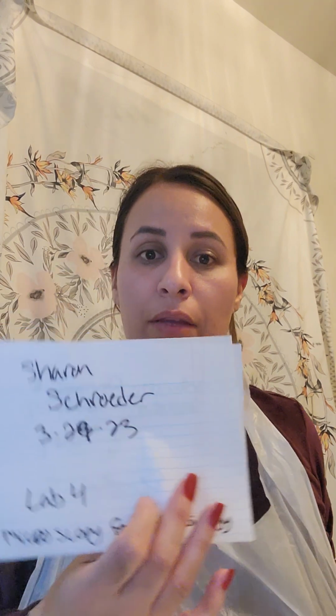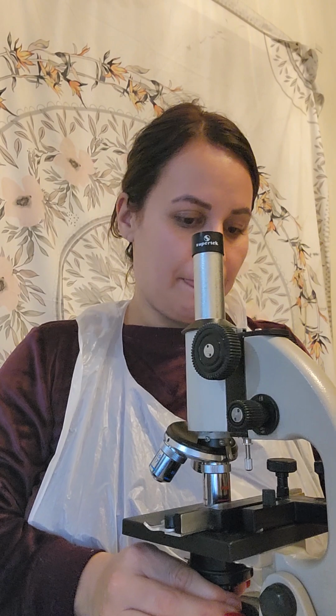This is exercise 1. It's the 29th of March, 2023 for lab 4, getting to know your compound microscope. I am using my computer again as a stand for my phone because I need to be able to read these instructions. Here's my microscope, and I already have it set up.